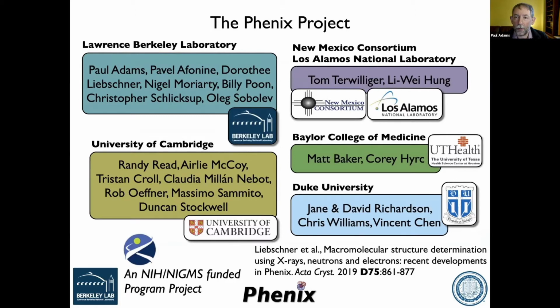Well, as far as I know, there's no accepted protocol for looking for problems in the FSC. I'm sure others could say more, but I'd be worried if there was very low correlation in the FSCs at low resolution.